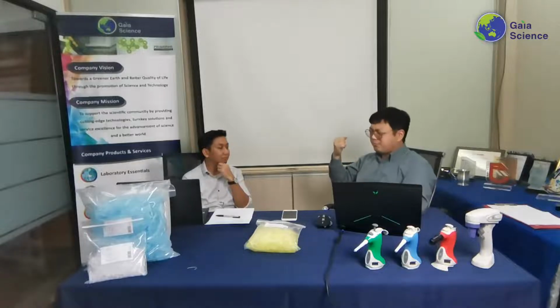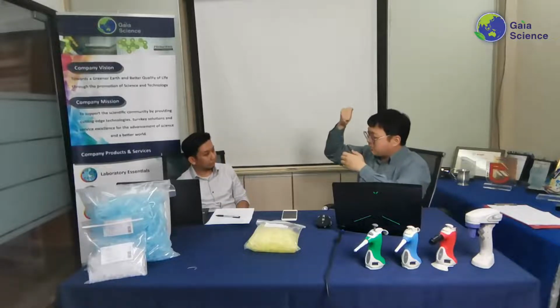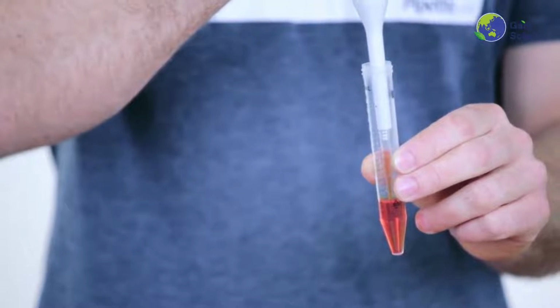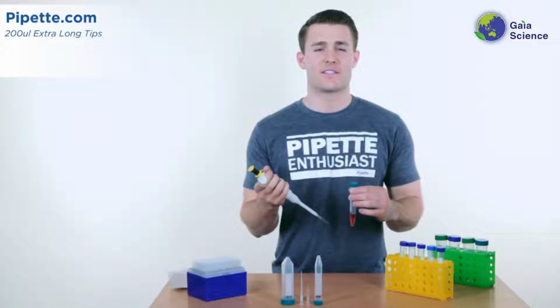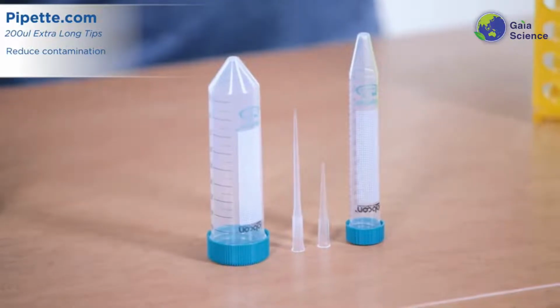It helps for 15 and 50 mL centrifuge tubes when you're trying to go in, so that the long tips will be able to reach all the way down there, and you're able to aspirate up and down. It doesn't affect the volume you aspirate and dispense, because that depends on the way it's manufactured. It's more on the practical use, whether it's easy for you to aspirate up and down.